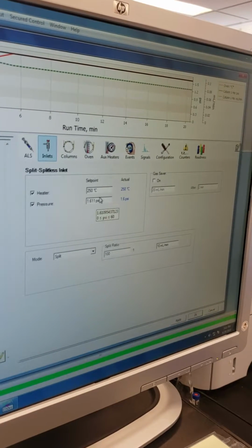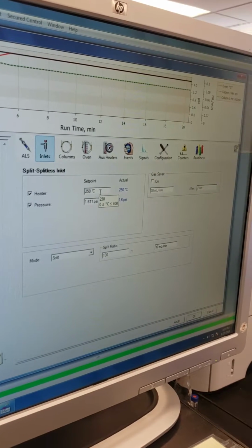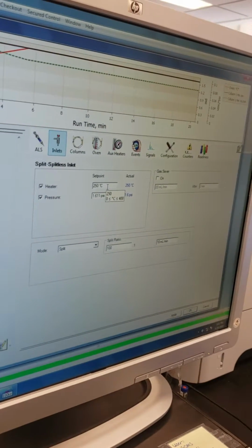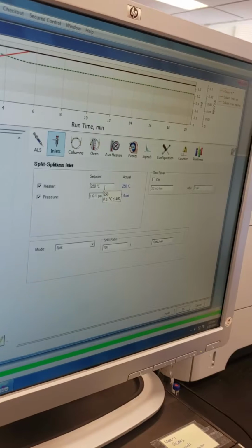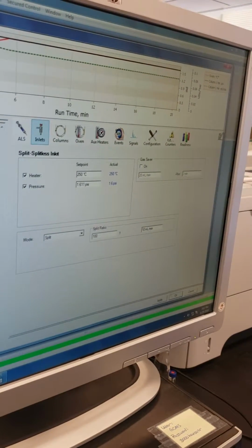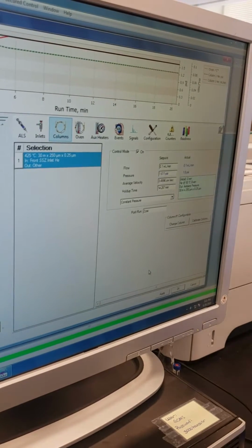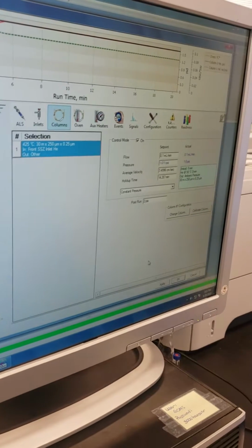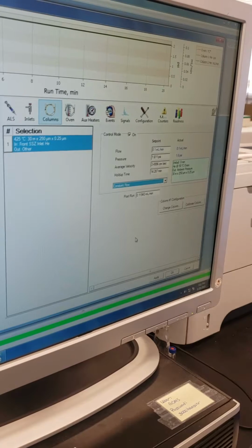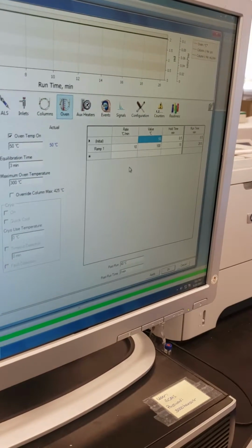Okay, and the temperature, I guess it will be fine. 10 and 50. What is the highest that you can go for set point? I'm not sure. Well, let's try with that one. If not, we can go back later and modify. Okay, so do you want to do constant pressure, constant flow? Probably constant flow. I think that would be a better option.